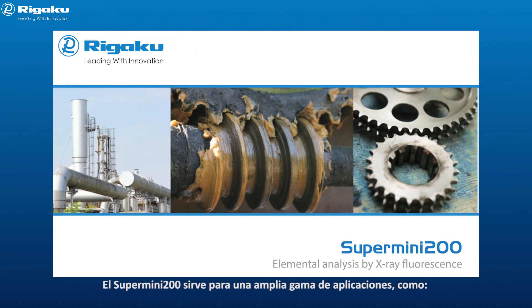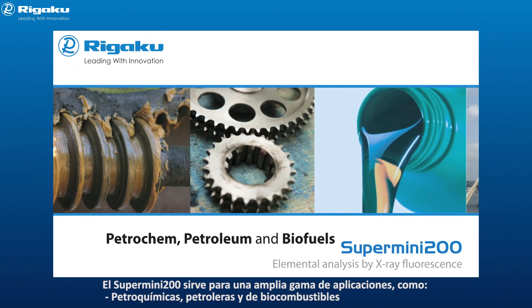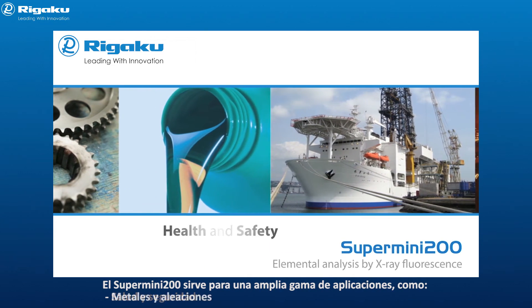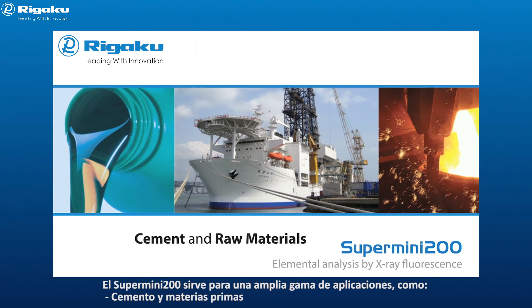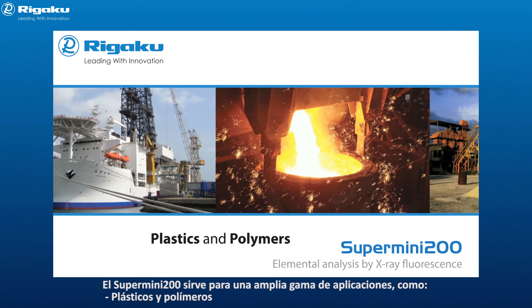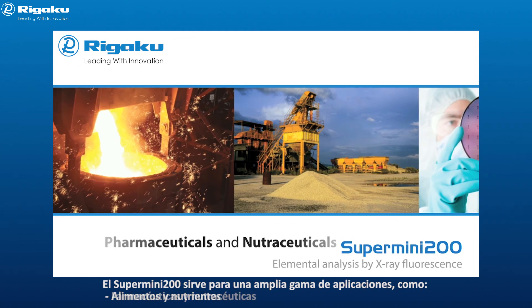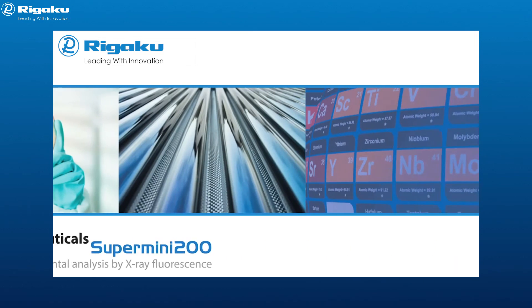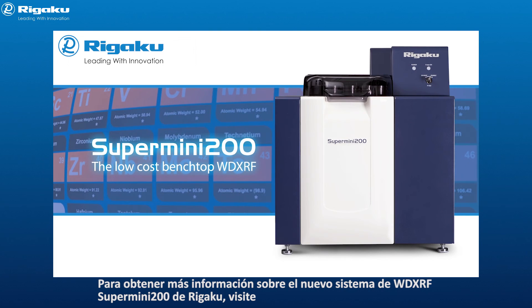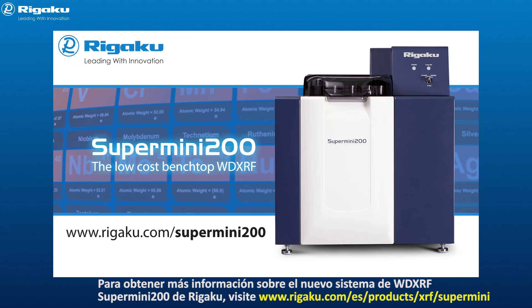The Supermini 200 is useful for a wide range of applications, including petrochem, petroleum and biofuels, lubricants and additives, health and safety, metals and alloys, cement and raw materials, layers and thin films, plastics and polymers, mining and refining, foods and food ingredients, pharmaceuticals and nutraceuticals. For more information about Rigaku's new Supermini 200 WD XRF system, please visit www.rigaku.com/supermini200.